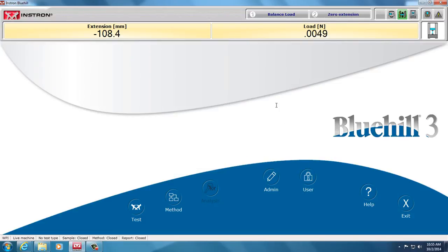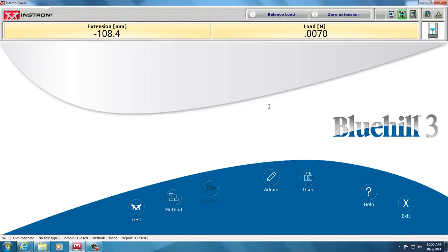I've also moved my crosshead down and set the physical stop, which is very important, so that I do not compress the material into the grips or the anvils and break the load cell.